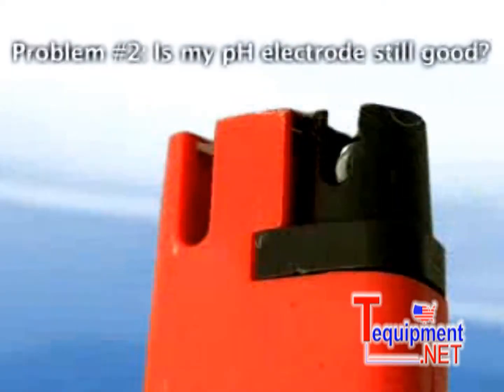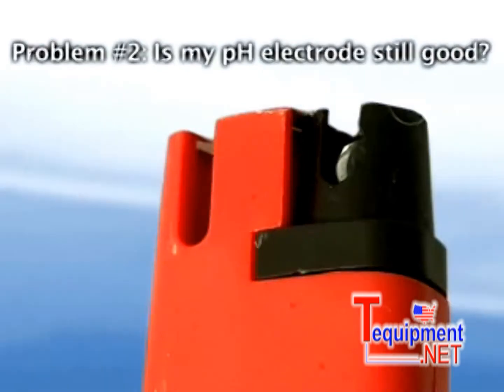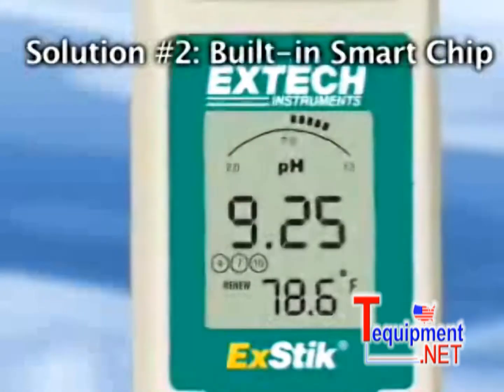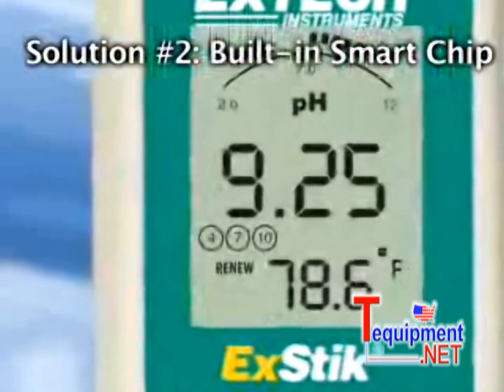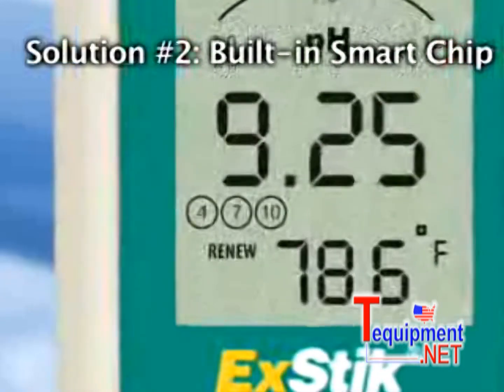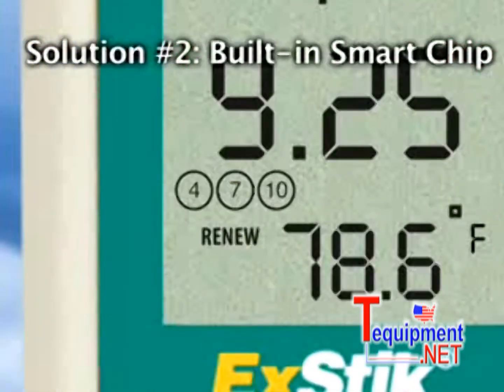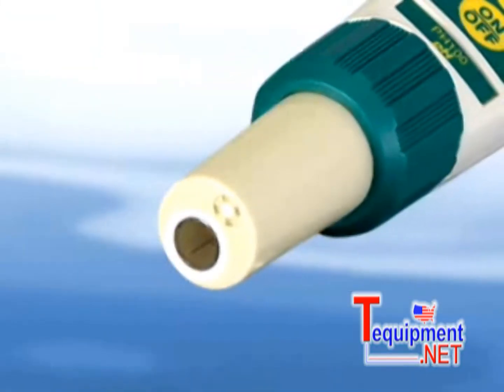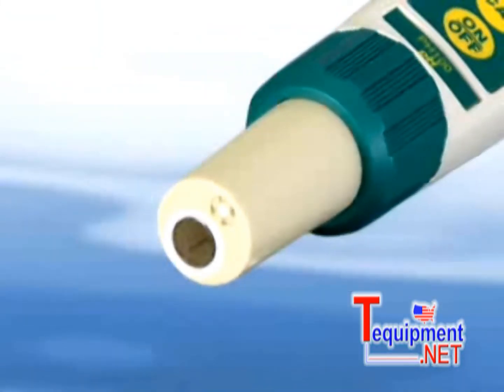Problem number two: uncertainty of not knowing how long the electrode will last and also the shelf life of storing an electrode. The built-in smart chip alerts the user when to replace or refill the EXTIC pH electrode. A renew indicator will appear when the meter senses the electrode not delivering optimal performance, telling you it is time to service or replace the electrode.